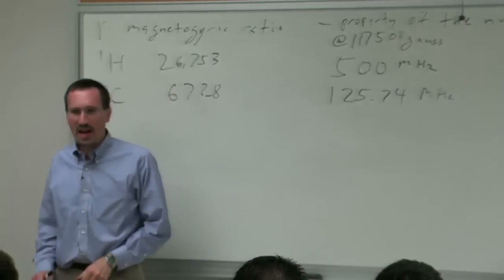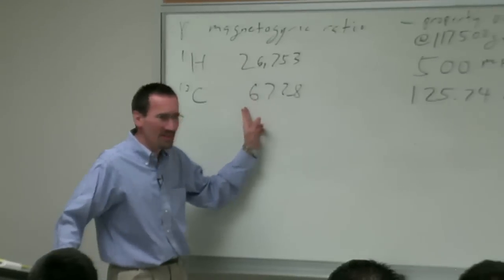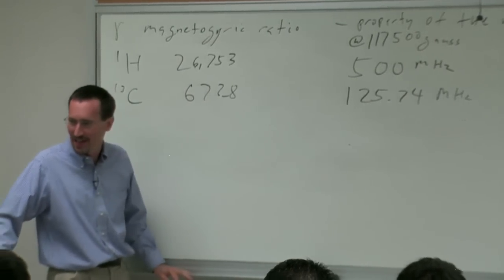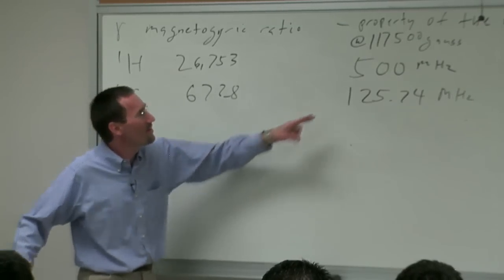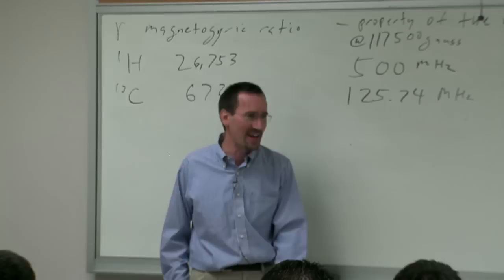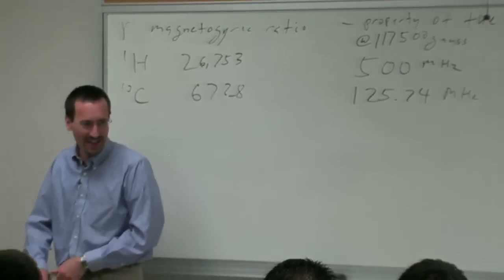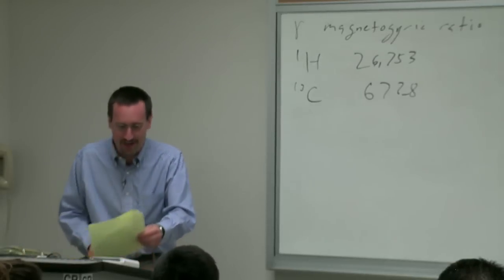Now, the other thing you have to remember is even though you're recording your C13 NMR spectrum on a, quote, 500 megahertz NMR spectrometer, you're not reporting your carbon NMR at 500 megahertz. If you were, you'd be that lucky person, not in France, but maybe on Mars, who has access to a 2 gigahertz NMR spectrometer. And there ain't no such animal right now.